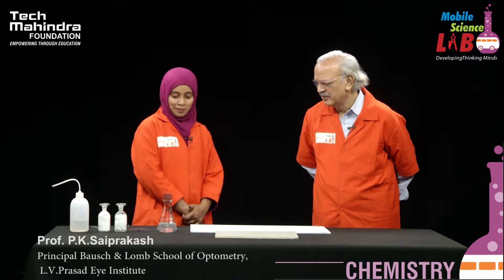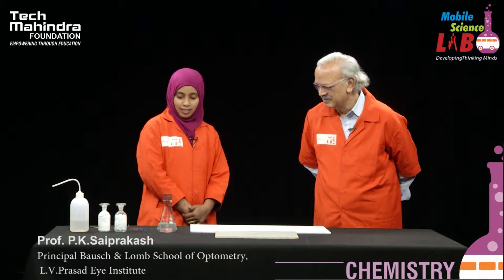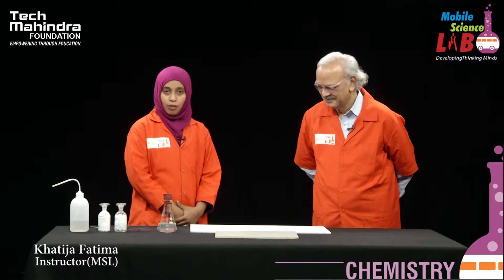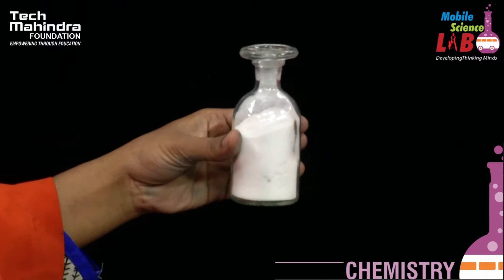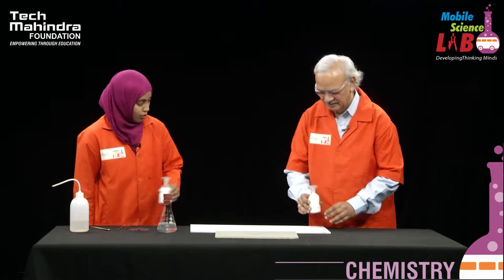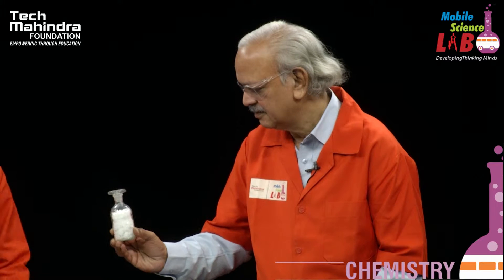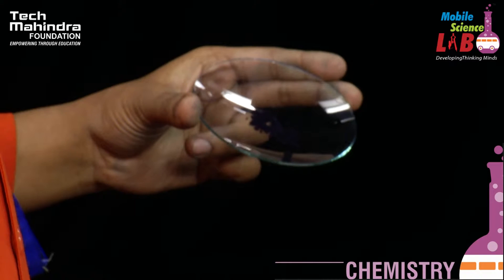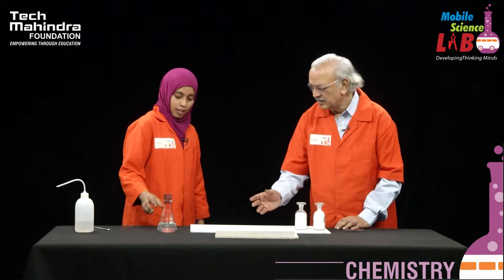Hello sir. Hello Khatija, how are you? Fine sir. Come with a new set. Yes sir. Now we are going to conduct a traffic light experiment. For this experiment we need dextrose, sodium hydroxide pellets, an indicator called indigo carmine, and a glass rod. Start the experiment.